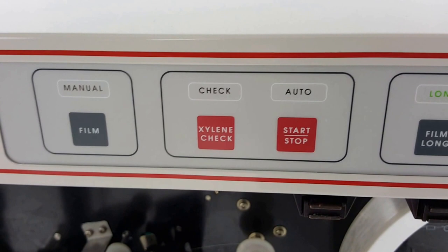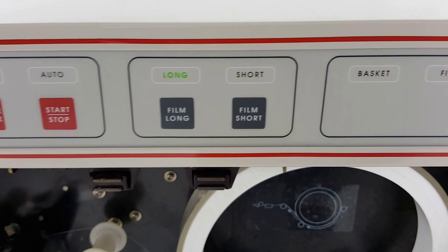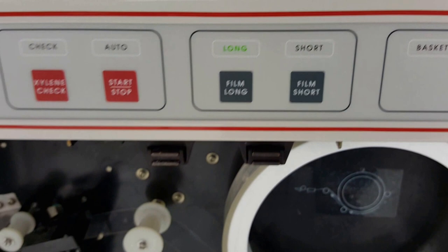The next button is the xylene check, which allows you to measure the amount of xylene per slide. The start/stop button is pressed when you have this all loaded up to start the cover slipping process. You can choose long or short film, and in the manual you can see how long and short those pieces of film will be.